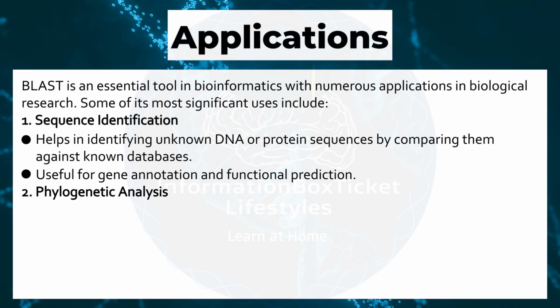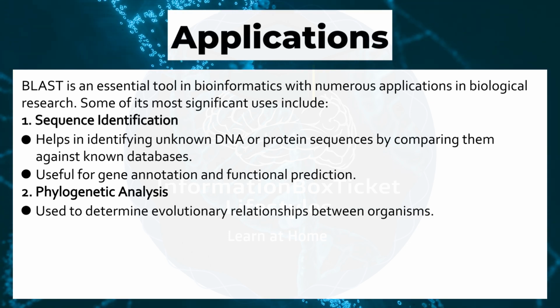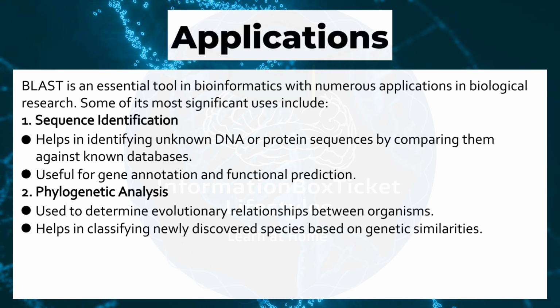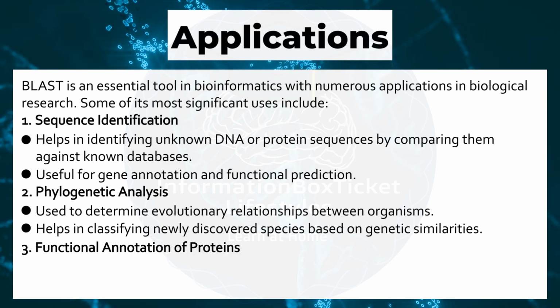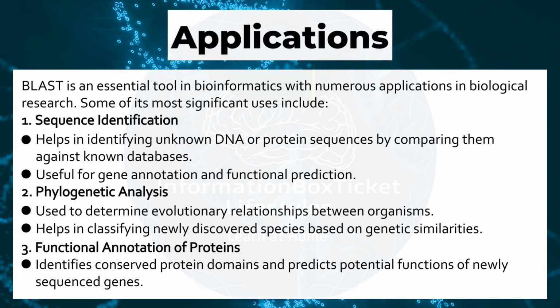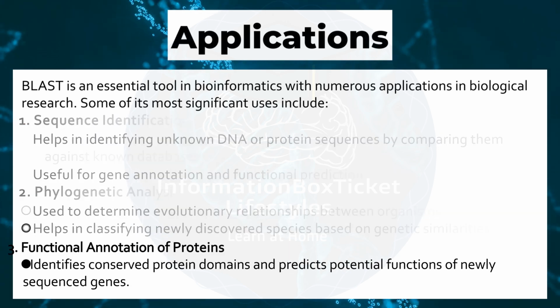2nd, phylogenetic analysis. Used to determine evolutionary relationships between organisms. Helps in classifying newly discovered species based on genetic similarities. 3rd, functional annotation of proteins. Identifies conserved protein domains and predicts potential functions of newly sequenced genes.